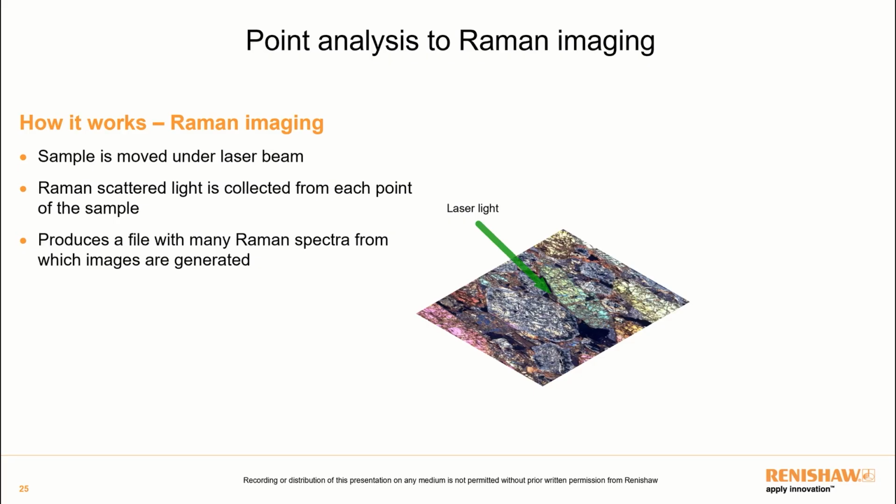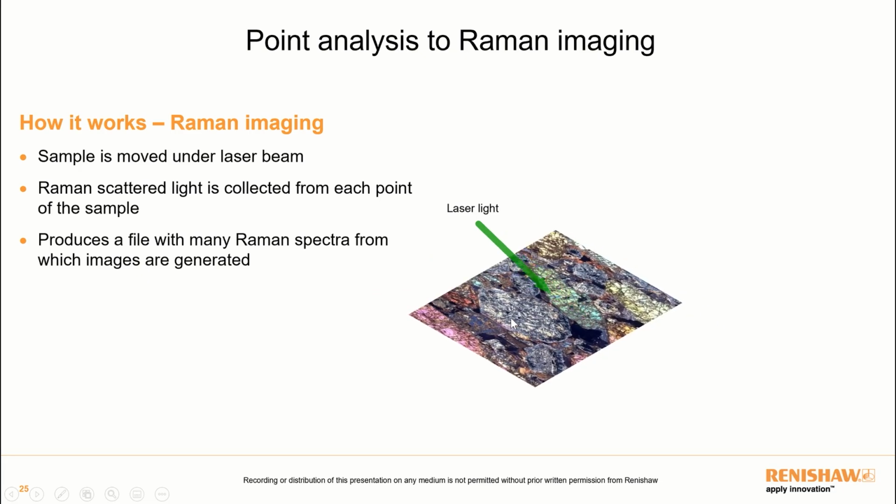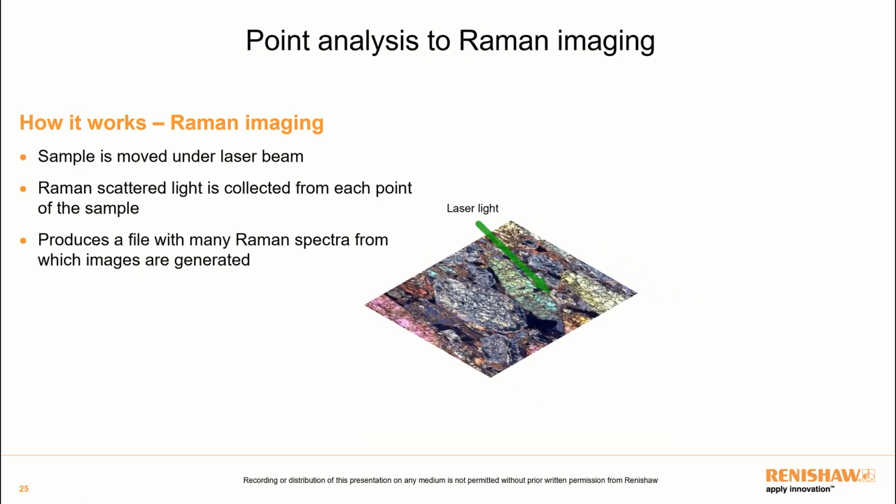As the next slide is a 3D image of an inclusion, I want to present here a slide that describes what Raman imaging is, starting from a 2D case on a mineralogical thin section of an ultramafic igneous rock that shows hydrothermal alterations. So in mapping or imaging, the sample is scanned under the microscope objective, and an entire spectrum is collected for each sample point.